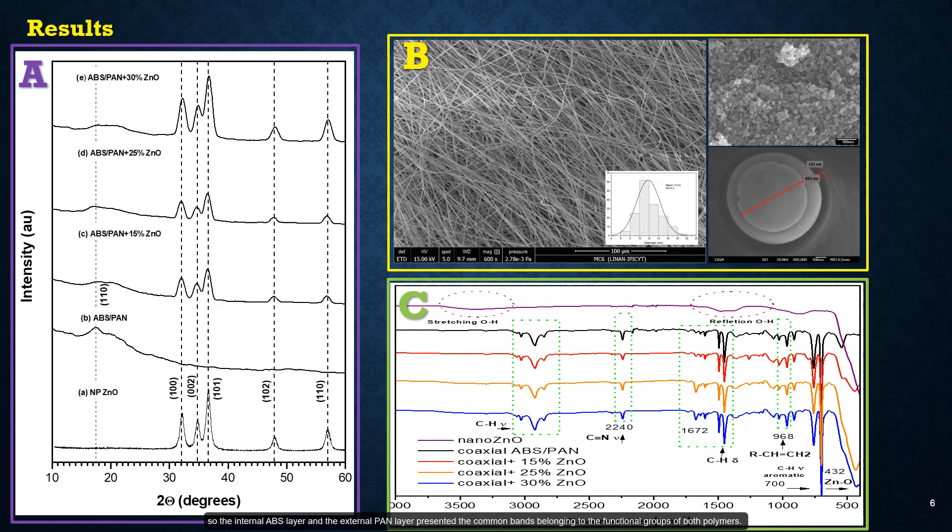The infrared analysis spectra of the fiber systems in figure C show that the electrospinning process does not modify the chemical structure of the starting materials. The internal ABS layer and the external polyacrylonitrile layer present the common bands belonging to the functional groups for both polymers. The incorporation of nanoparticles to the polymer composite fiber produces very small differences in wave numbers in the infrared spectral analysis. However, the intensities decrease slightly with respect to the pristine zinc oxide nanoparticles, from which it could be inferred that the interaction between the zinc oxide nanoparticles and the ABS polymer matrix is physical and not chemical.